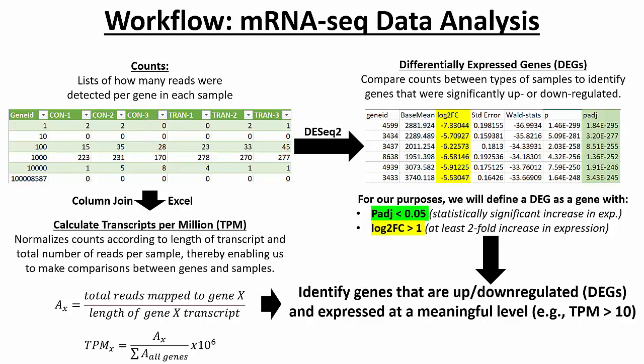And the reason for that is, if I wanted to ask the question of, is gene 1000 here expressed at a higher level than gene 100? If you look at the raw counts for the controls, for example, here, you might say, yeah, it looks like there is about a 10-fold increase in expression there, right? We're averaging about 20 here with gene 100 and we're averaging 200 with gene 1,000 here, right? That's what it would look like from the counts, but that might actually be incorrect.